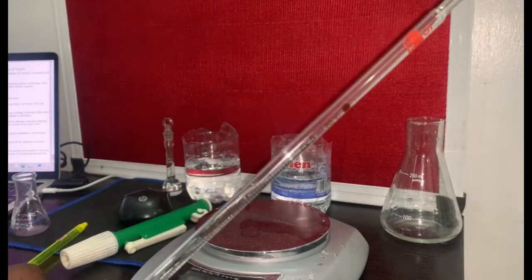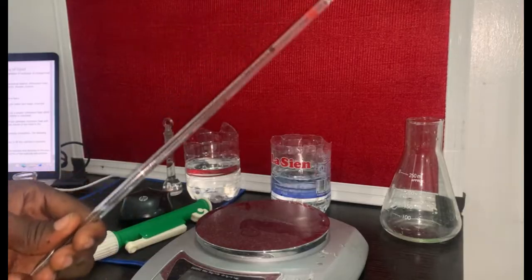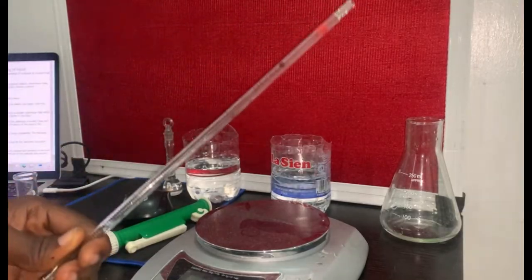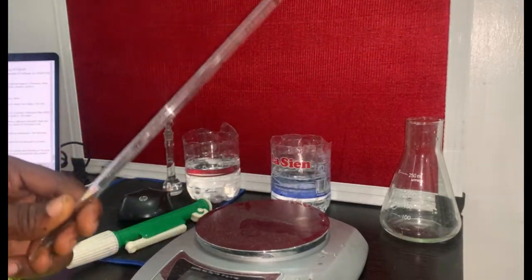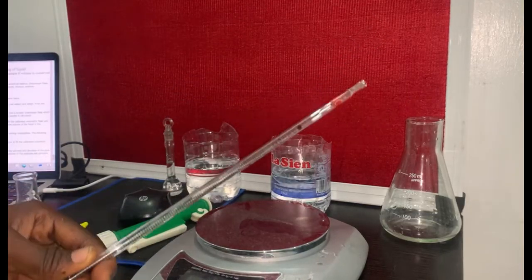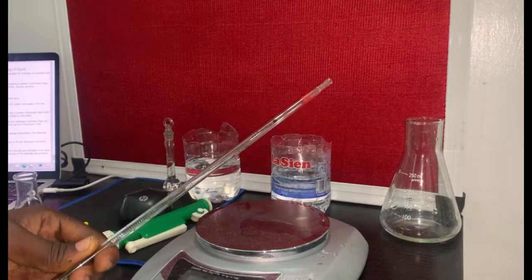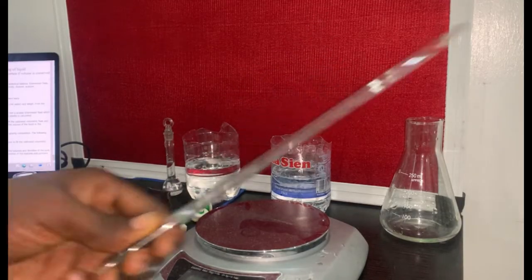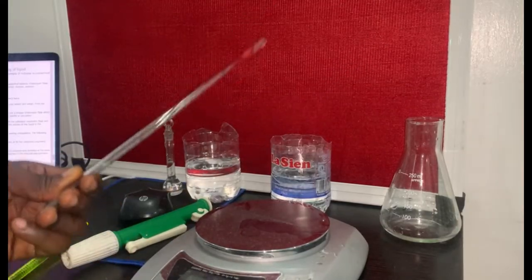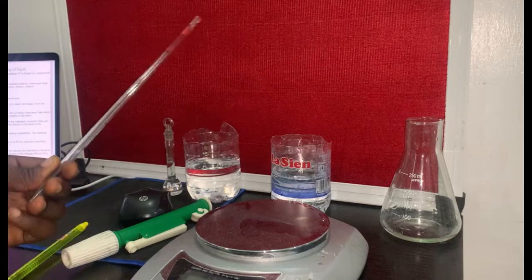That is in a case where they give you a 10 mil pipette in the lab. But since a 5 mil pipette is what I have here, and we are told to carry this out 5 times, the sole aim of carrying it out 5 times is just to avoid error. So if you do it once and it gives you 5, you do it 5 times, 5 in 5 places divided by 5, it's still going to give you 5. So why would you want to stress yourself running it 5 times?